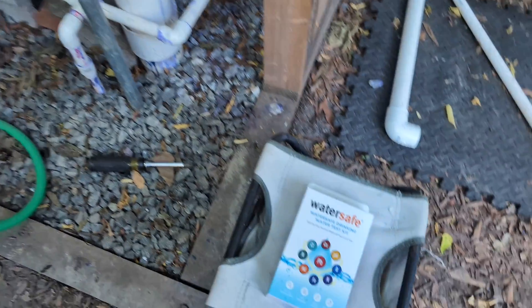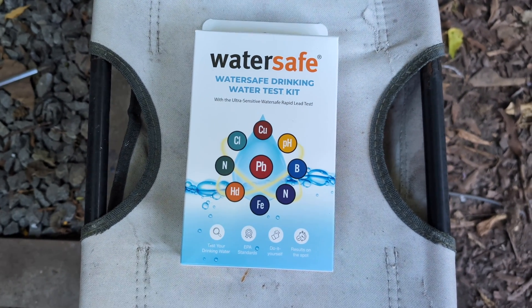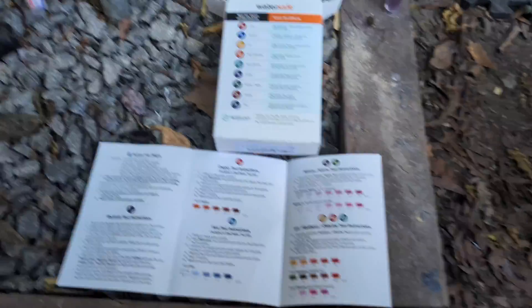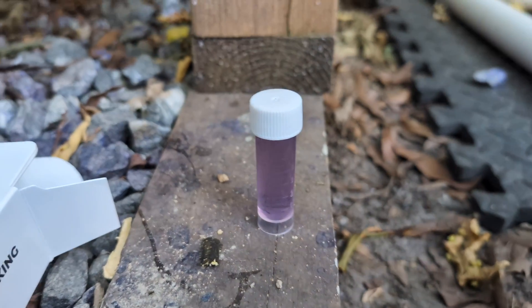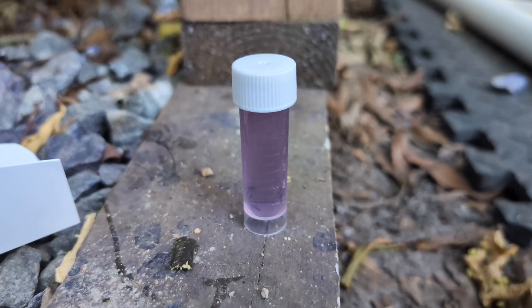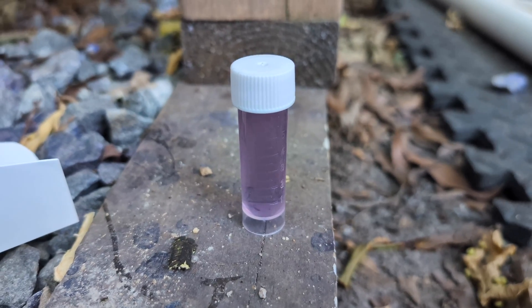All right, the time has come. I'm going to finally test my well water and see what is in here and see if by some miracle that I can drink this stuff. Step one is the bacterial test. It says fill this little vial with water and shake it up, which I did. It's purple right now and it says let this sit here for 48 hours.